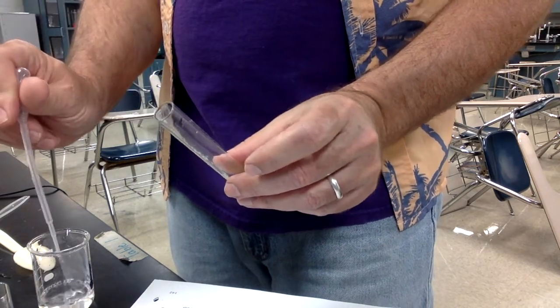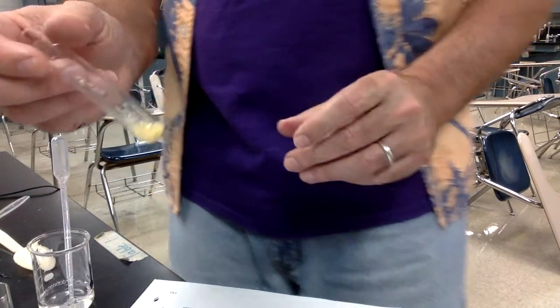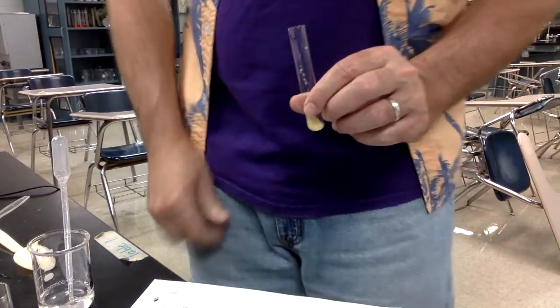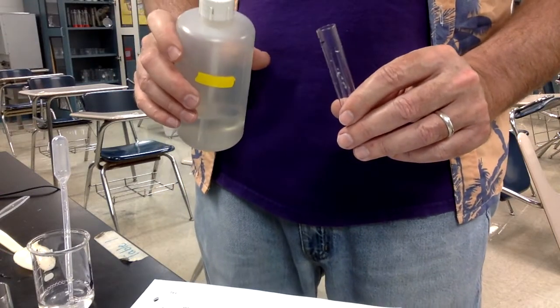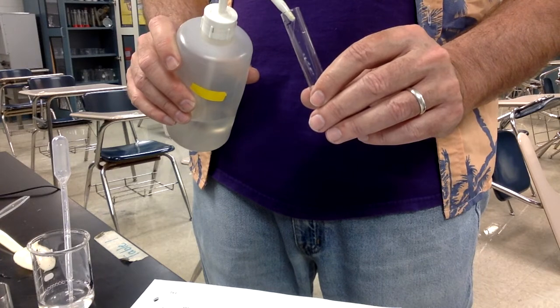Careful to not get the solid, just get the liquid part. I've done a pretty good job of taking the liquid off of the solid, but we are going to wash this with 6 milliliters more of fresh distilled water.